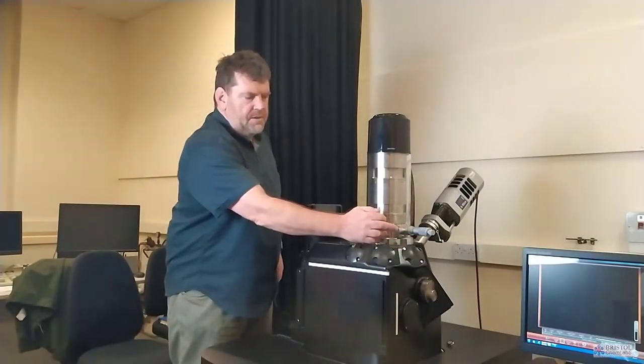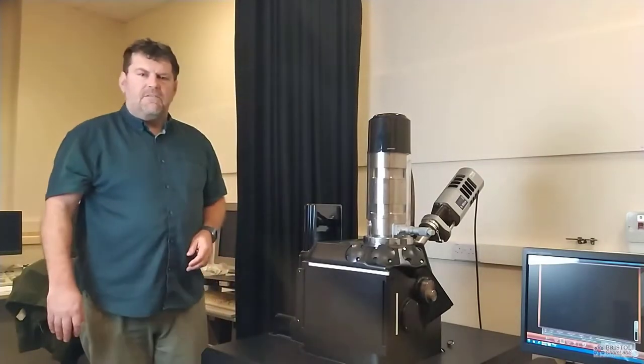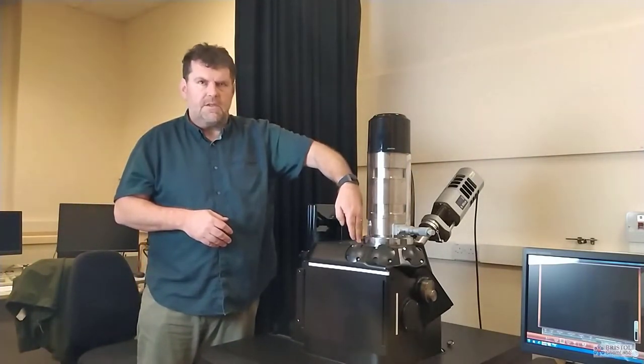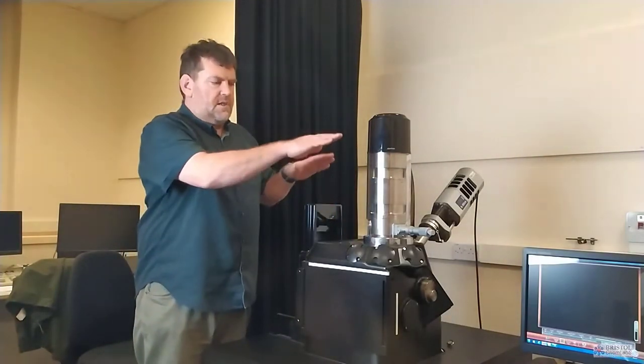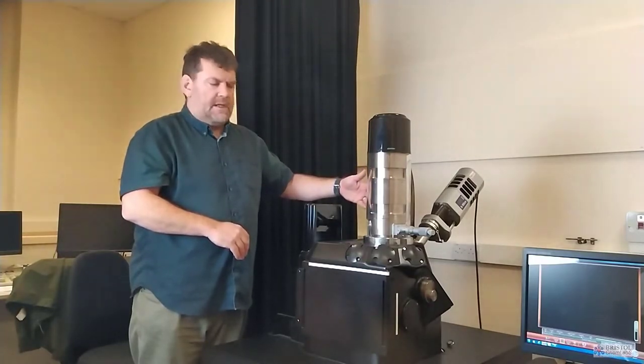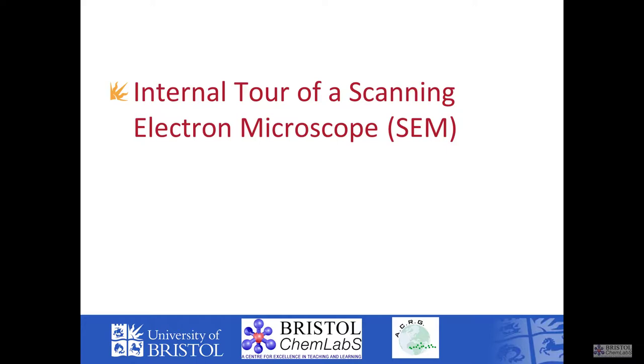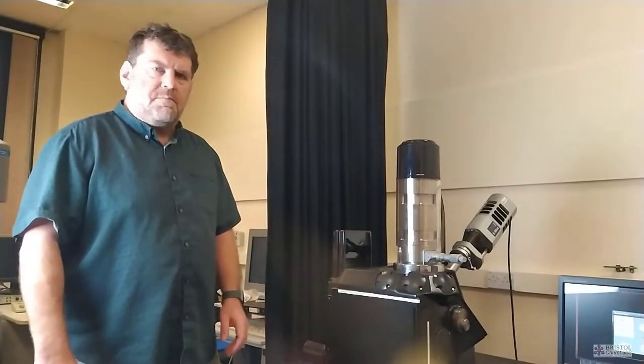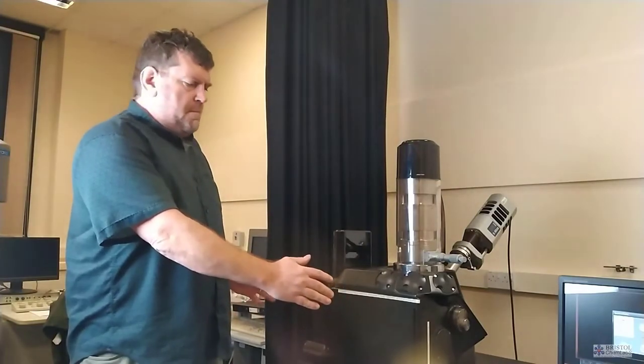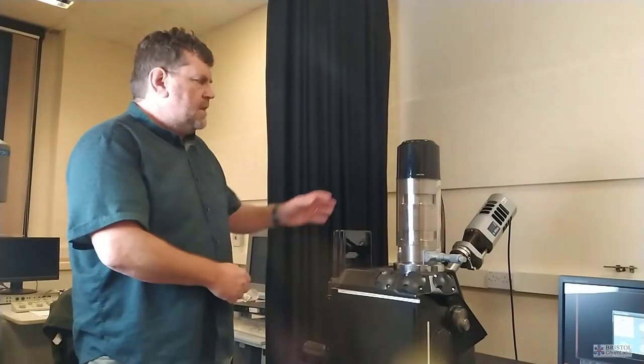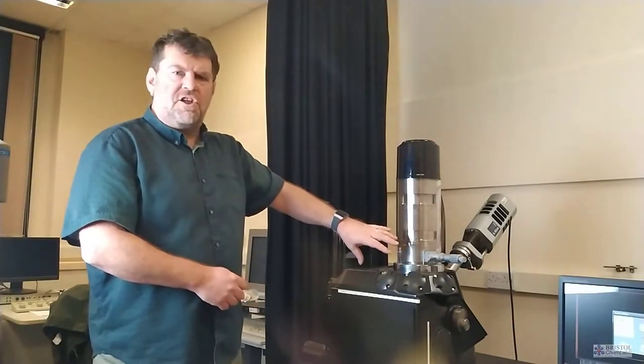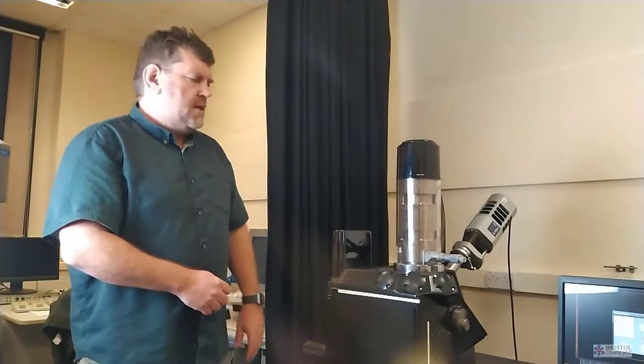At the side we have some apertures. The construction of this microscope is different to an optical microscope. Here we're producing a beam of electrons which are fired down onto the sample. Most of the detectors are above the sample and are collecting either electrons for imaging or x-rays for chemical analysis. The electron beam travels down a very narrow channel. Most of the large base unit is just electronics and pumping system. The electron beam itself is generated in the electron gun and only fires down a ball about a millimeter wide.